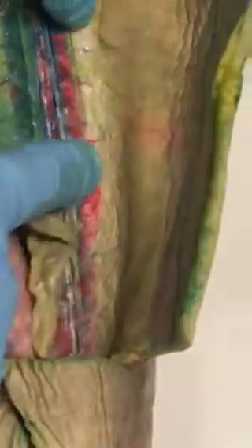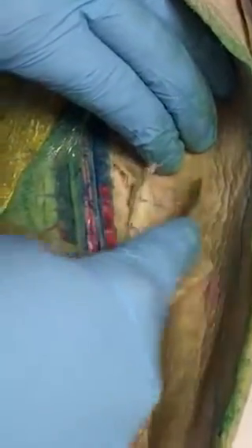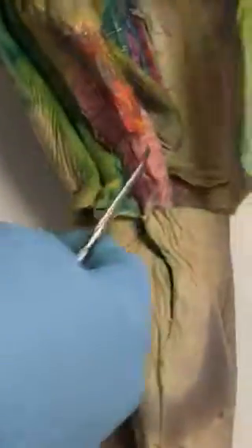You want to do the kidneys? It's really, really hard to see the kidneys. They're not along the line. They're underneath the skin here. This little noodle-y thing, that's the kidneys. They're not like their own structure. They're in the wall.